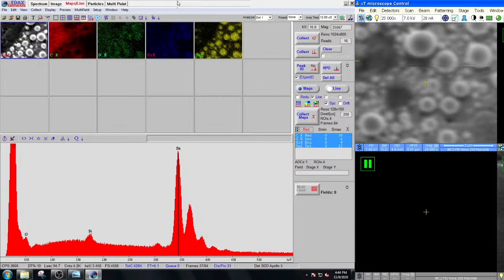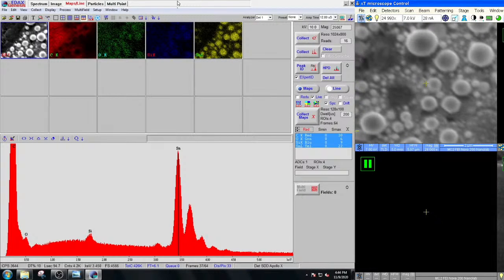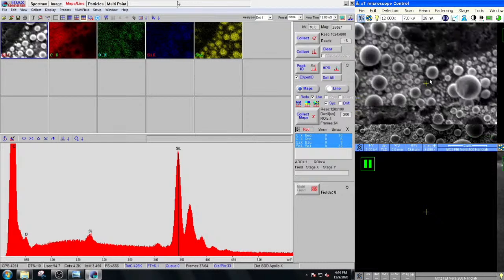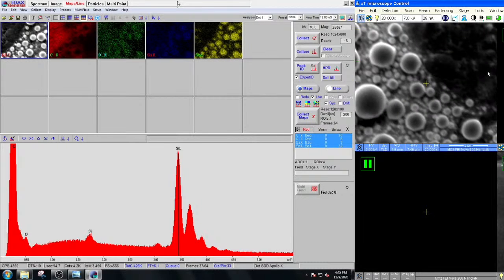To be honest, what I'm expecting to see is that we're not going to get those small particles just yet. The last step that I'll show you is we're going to put the SEM into the high resolution lens mode, and that will hopefully be the final thing we have to do to map those small tin balls. Okay, let me get away from this big tin sphere so we're not getting shadows. Don't want that. Okay, so that looks pretty reasonable.